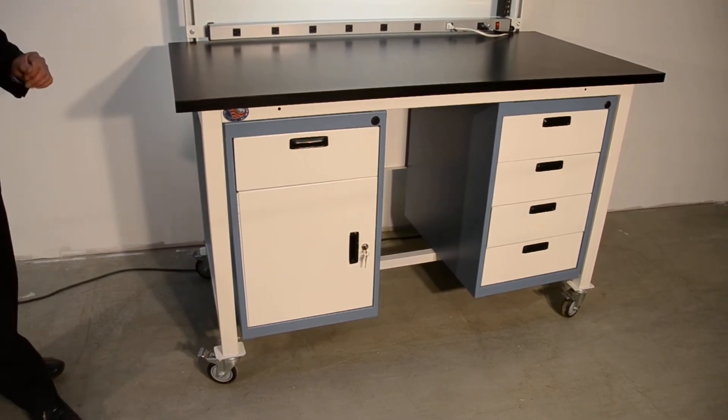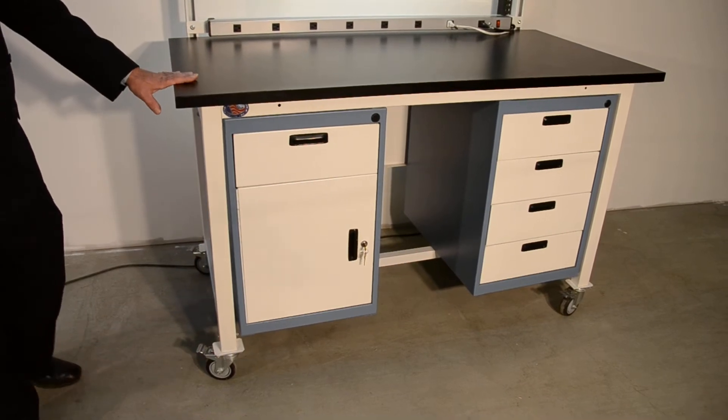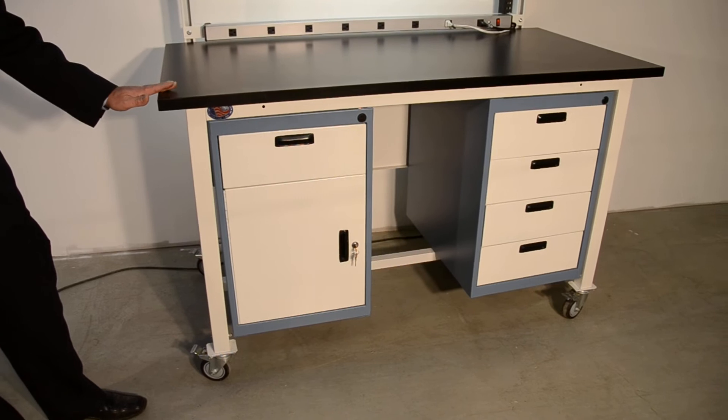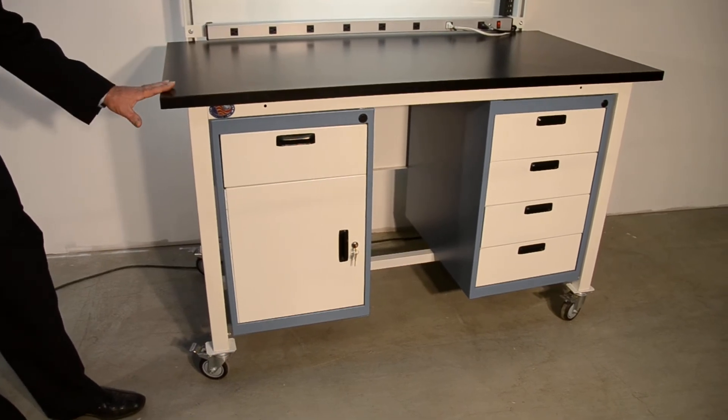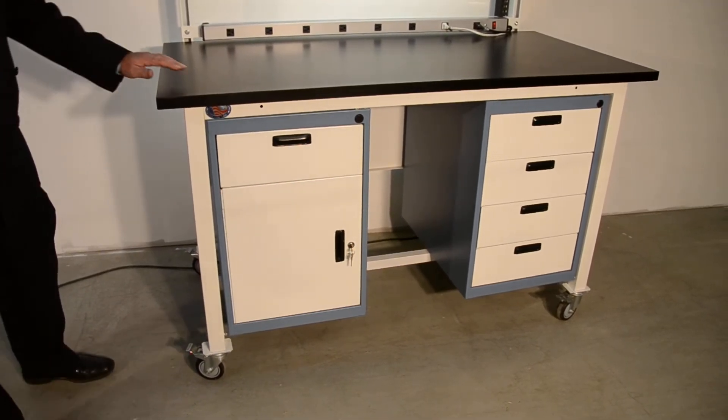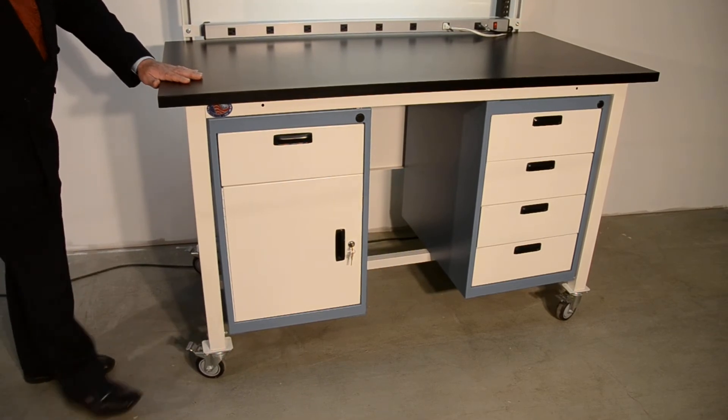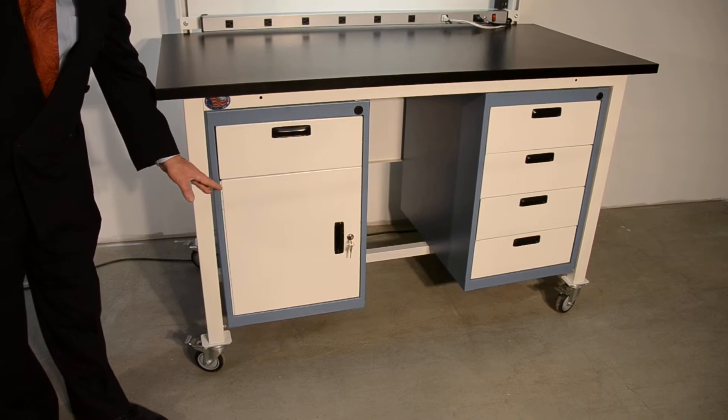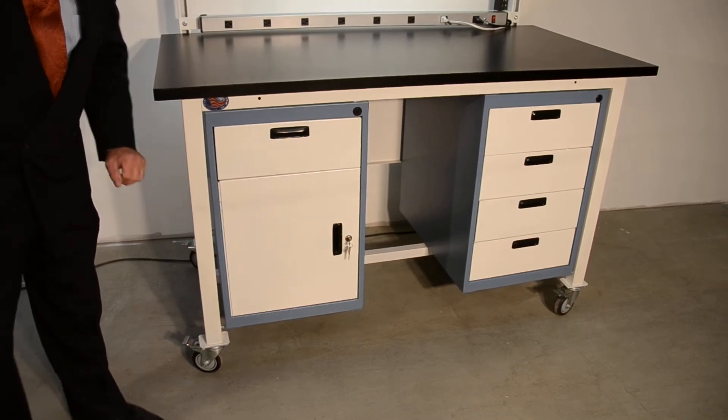Some of the accessories, and I did want to mention it has a 5,000 pound capacity on this workbench. Built on our HD platform, however, what we've done is we've lowered what we call our side footrest, that's the brace that runs from leg to leg, and we've increased the height of it in order to make enough room for our 27.5 inch lavatory cabinets.